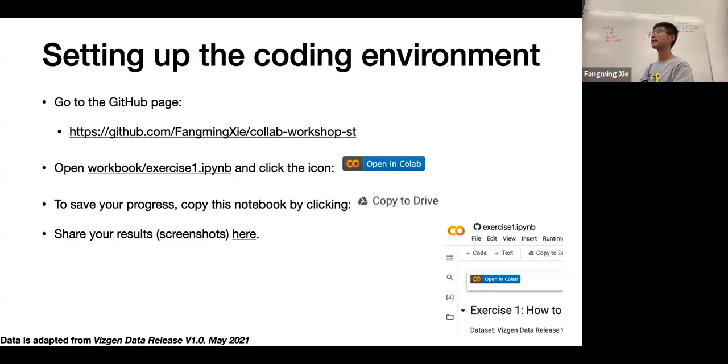So do I get a consensus table in output? Yeah, the raw data will still be, for each section, you will have a set of tables like this. Okay. Then you begin to worry about how to integrate them together, right? For example, the raw X and Y location wouldn't make sense when you just simply put them together, because one section is over here on the micro, the other is over there.